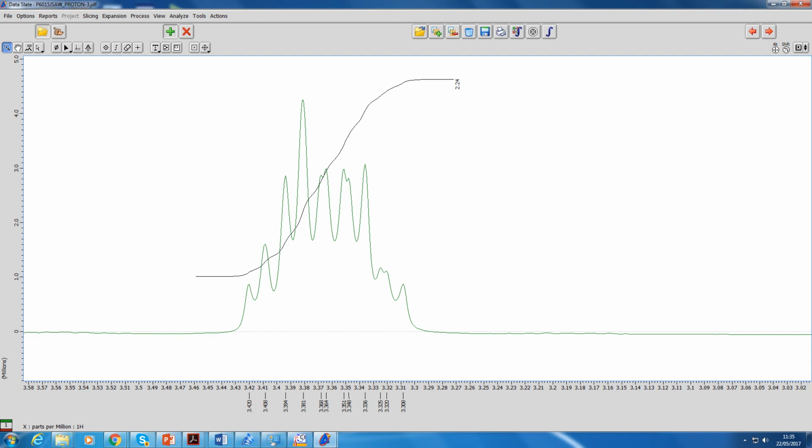And I would suggest just use these colours, and if you want to change the colours later, do it in, say, Windows Paint or something like that. You've got at the top left of the screen the two tabs. On the left is your first initial, and on the right is the spectra that you've added. You want to flick between the two. You can flick between those two. You do integrations, etc., on these.